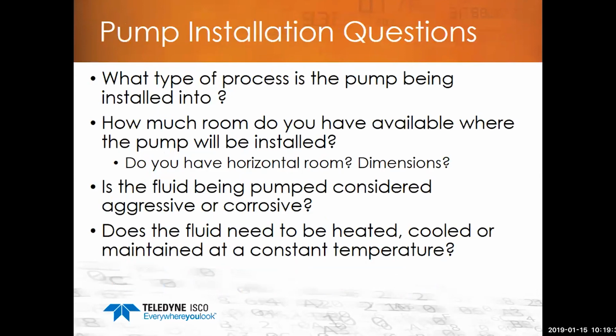And then you want to look at the other types of installation questions. What type of process is the pump being installed into? Is it a desktop? Excuse me, a lab scale where it's sitting at the top of a fume hood? Is it sitting on a counter, or is it in a pilot plant that's a small setup, or is it in scale up, or is it in production? I mean, some facilities use these types of pumps in full production.